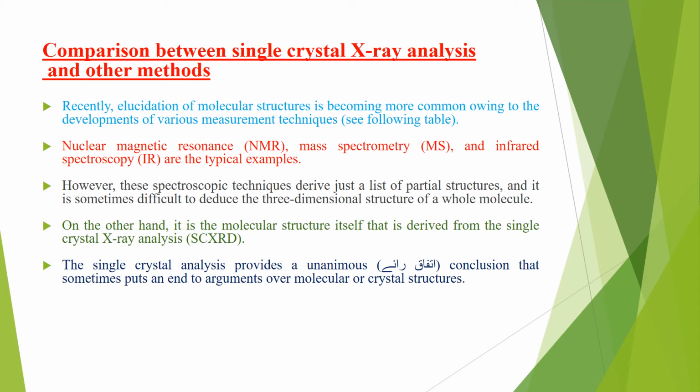However, these spectroscopic techniques derive just a list of partial structures, and it is sometimes difficult to deduce the three-dimensional structure of the whole molecule.